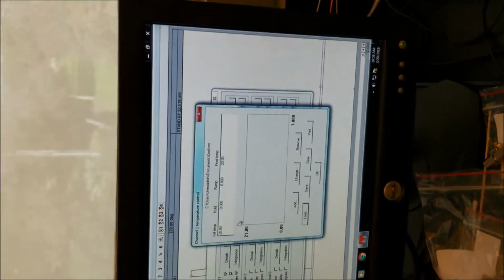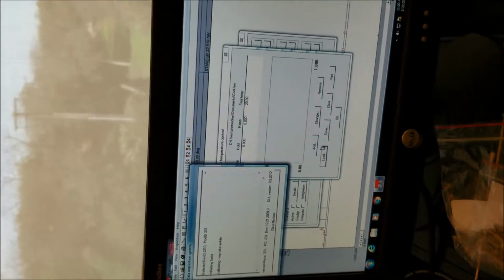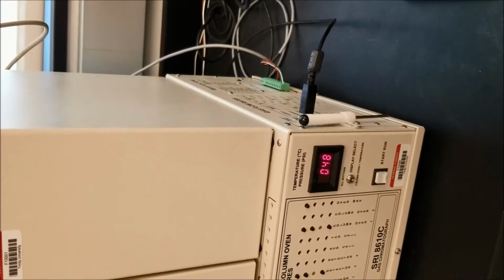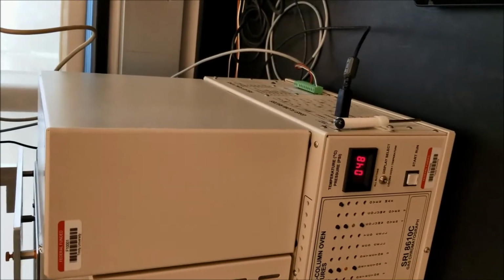It's labeled Cool because it is a so-called cooling method. Right now it's going to interface with the system, and it's already powering down the temperature. So you're going to wait until this temperature gets closer to room temperature. I wait until it's below 30 degrees Celsius.